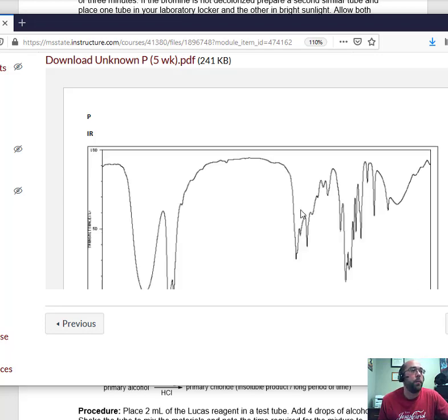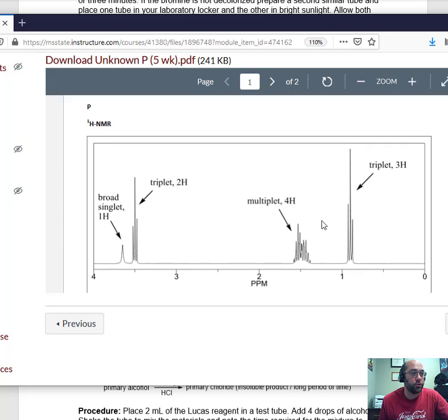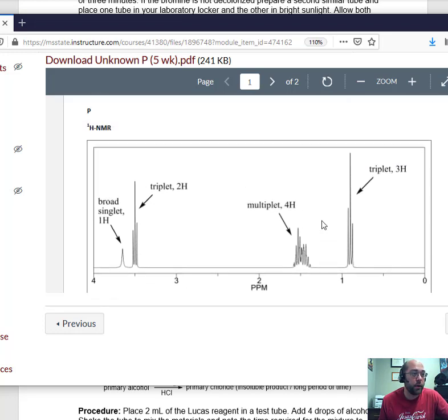All right, but of course, as we know, the best way to determine our mass and our structure is going to be to use the proton NMR. And so here I can use this to give me more information about structure. So, the splitting, you see how many hydrogens there are, right? So there's a total of 3, 7, 8, 9, 10. There's a total of 10 hydrogens there.